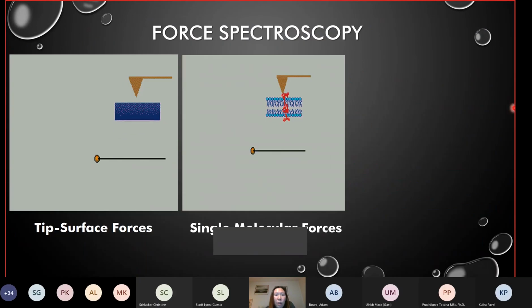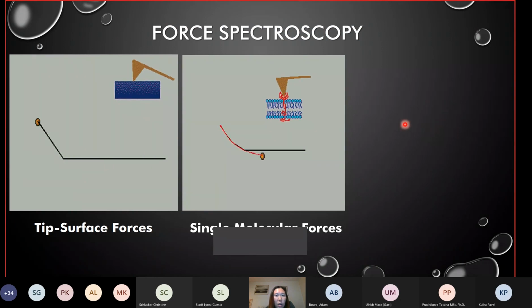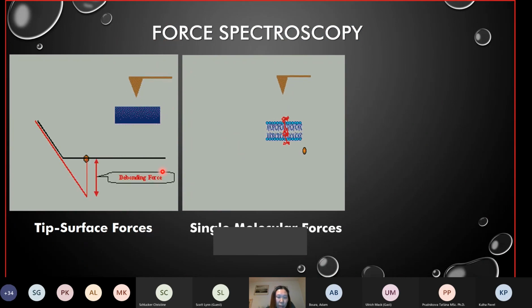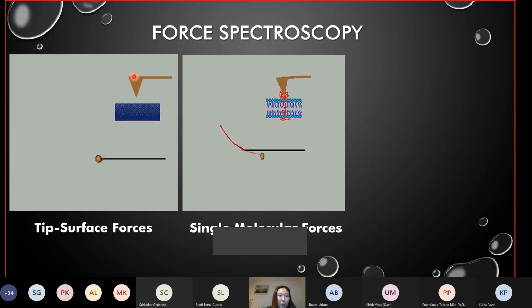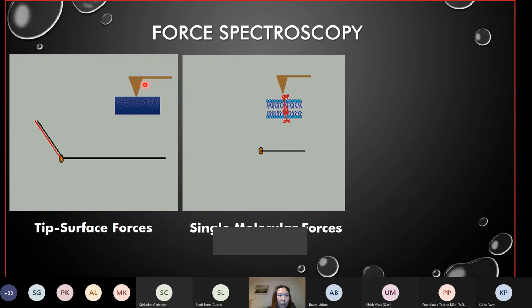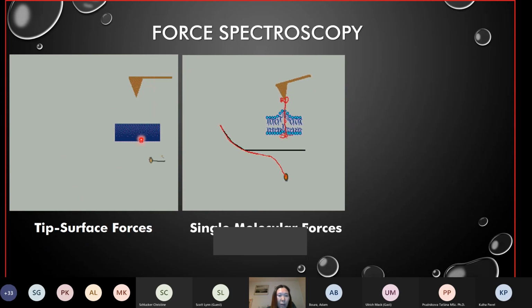Another advantage of AFM is that we can use it as a force tool. Here is the so-called force spectroscopy mode. We can move the AFM cantilever to the surface up and down. And then these laser deflection traces go like this, as you can see, go up, and as the cantilever bends, then also go down. And when they detach, they return to the normal position.